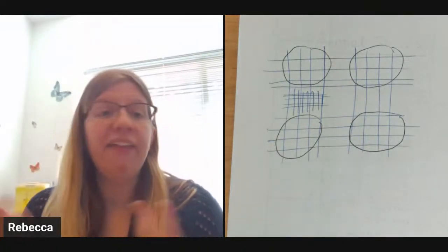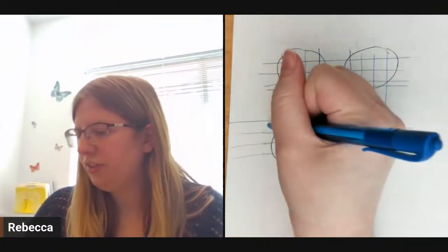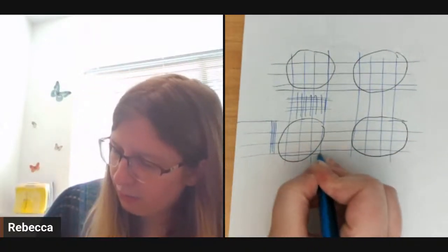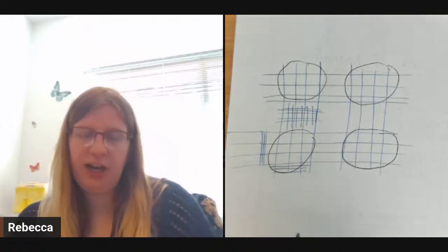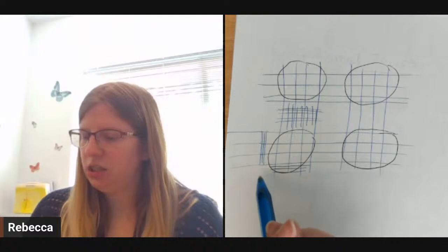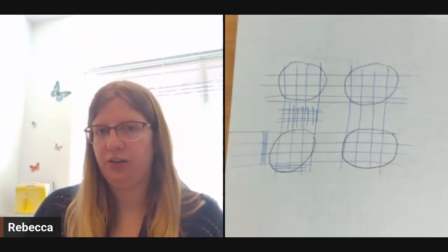And then what's nice about our hemocytometers is you'll notice that these lines will continue going even out of the center portion of the grid, but there will be, to close off this square, a little close grouping of 3 lines, and the same for the other side that's outside of it. And so that will really help you know where you are on the hemocytometer. If you look for those 3 groups of lines, you'll know that they're always on the outside 2 sides. So then you know which of those major squares you are in.